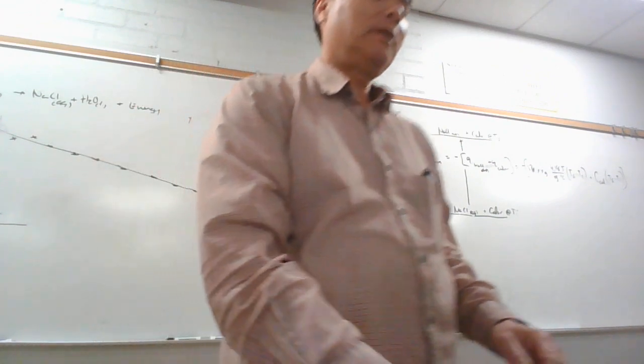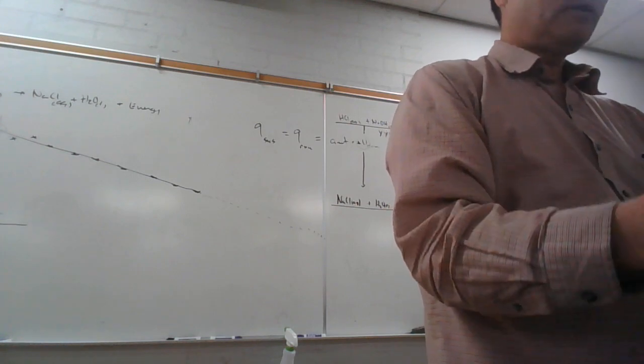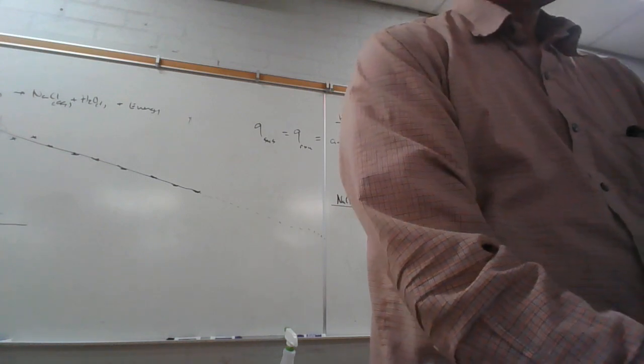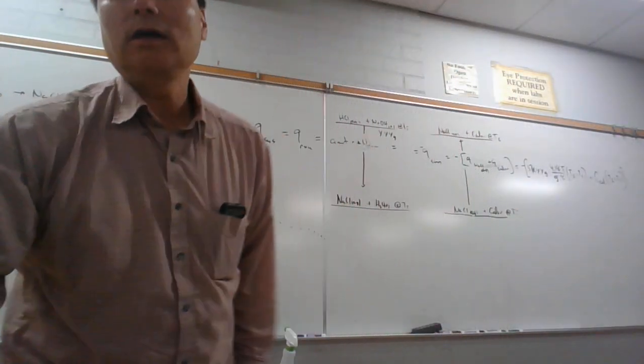So today we're doing the vacuum filtration, so you're going to have to set this up. If you need any help, let me know. But go ahead and check out the equipment from the stock room, and we'll go ahead and filter.